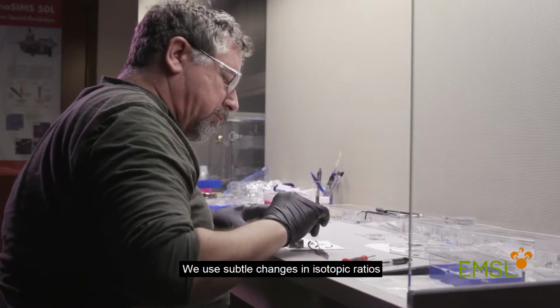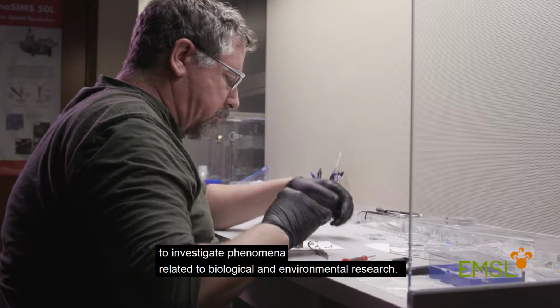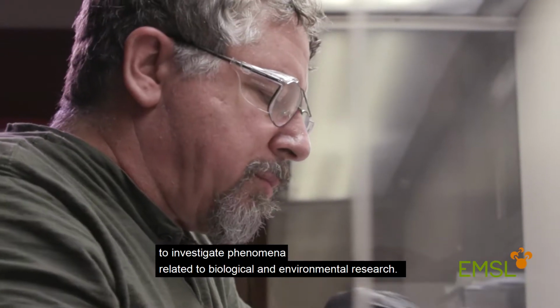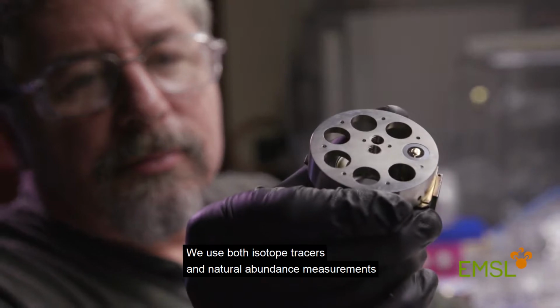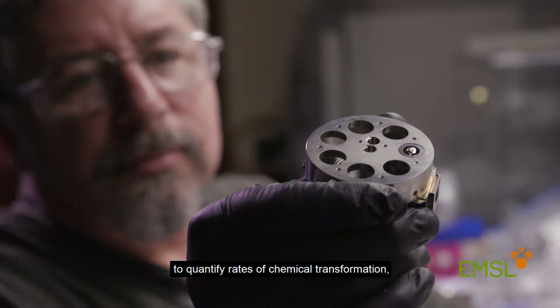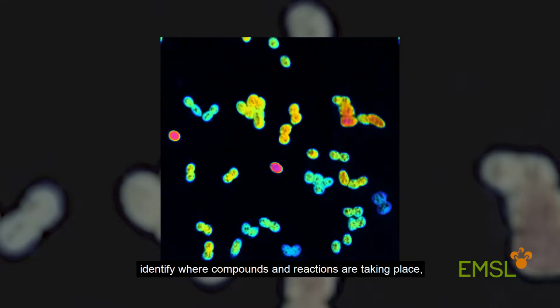This integrated research platform focuses on isotope and chemical analysis. We use subtle changes in isotopic ratio to investigate phenomena related to biological and environmental research. We use both isotopic tracers and natural abundance measurements to quantify rates of chemical transformation, identify where compounds and reactions are taking place, and identify the organisms linked to these processes.